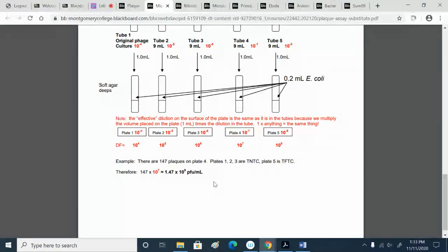No, but probably once you say it, I would have heard of it. Have you ever heard of titer? T-I-T-E-R, titer? Yeah, I've heard of that. Right, so titer just means concentration. It's another word they use sometimes, and usually when they're talking about viruses, they use titer. But T-I-T-E-R is the same as concentration.